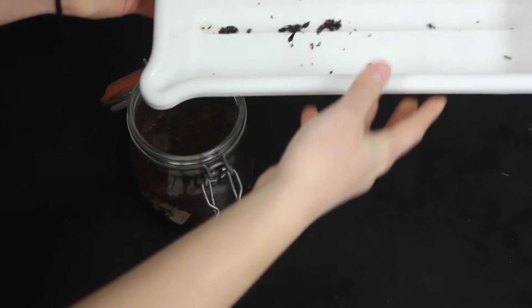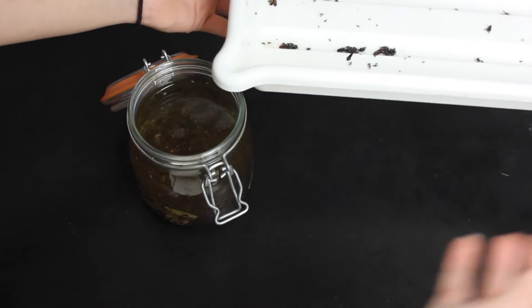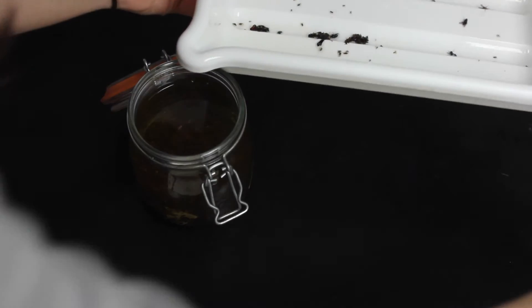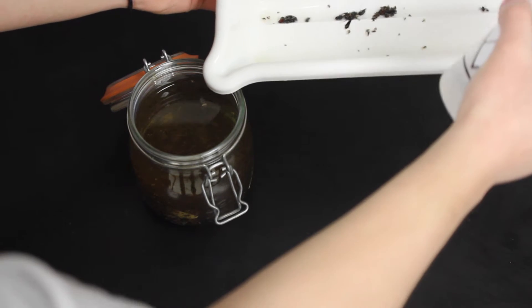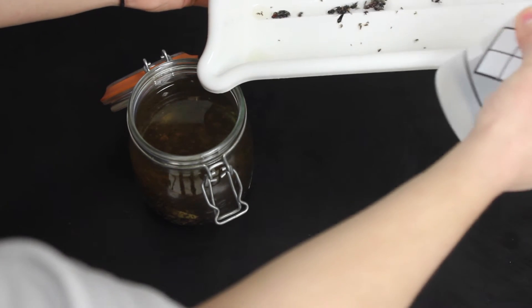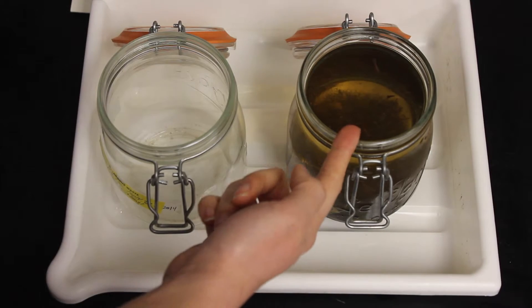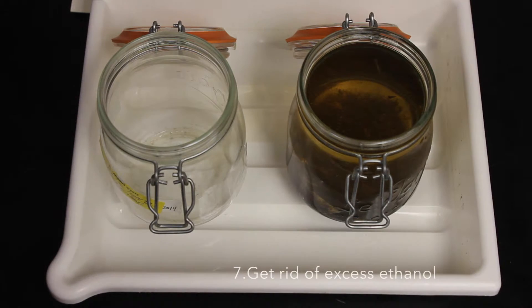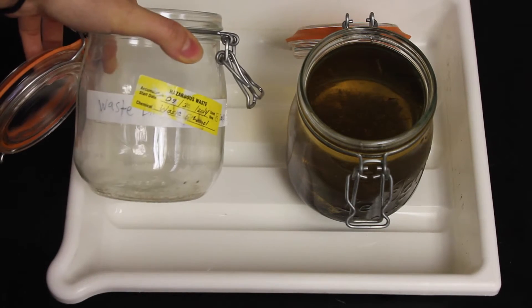As you can see, some of our specimen are still stuck to our large sorting tray. So we take our squeeze bottle full of 95% ethanol and wash them off. As you can see, there's too much ethanol in the jar. We need to get rid of it by placing the ethanol inside our waste jar.